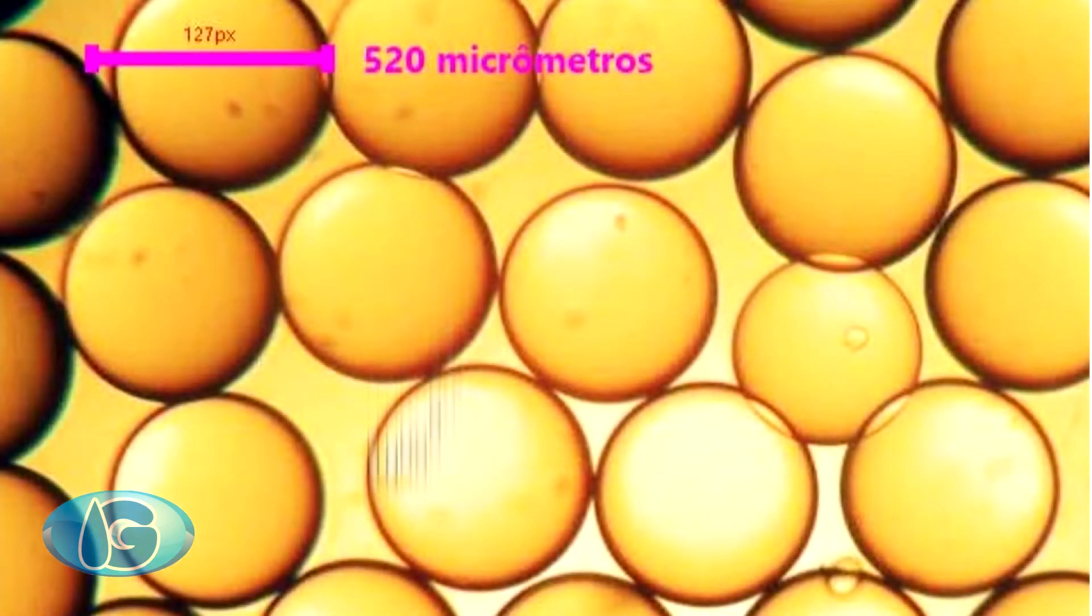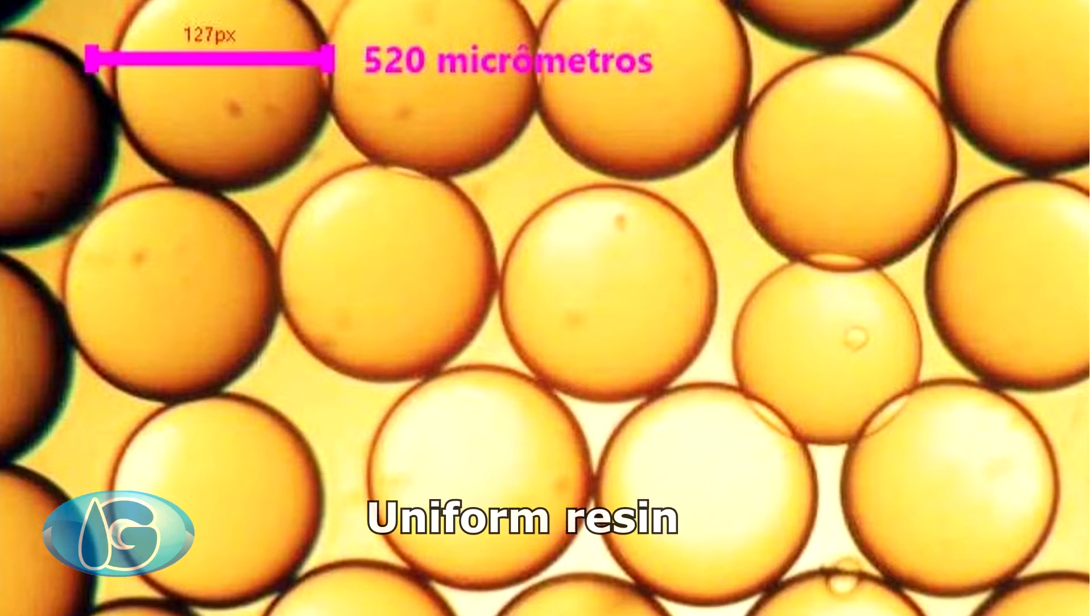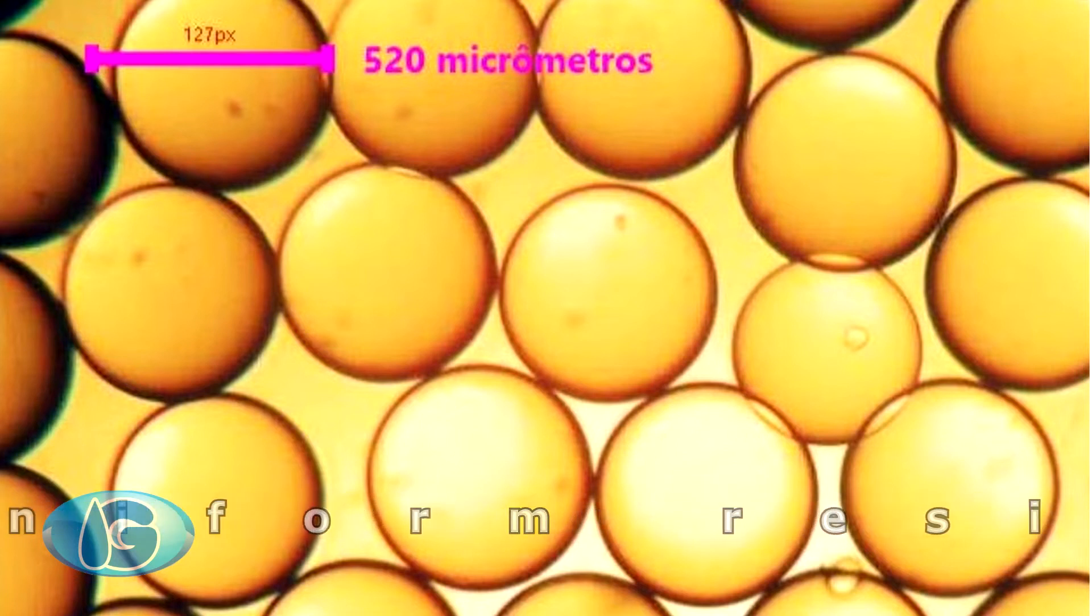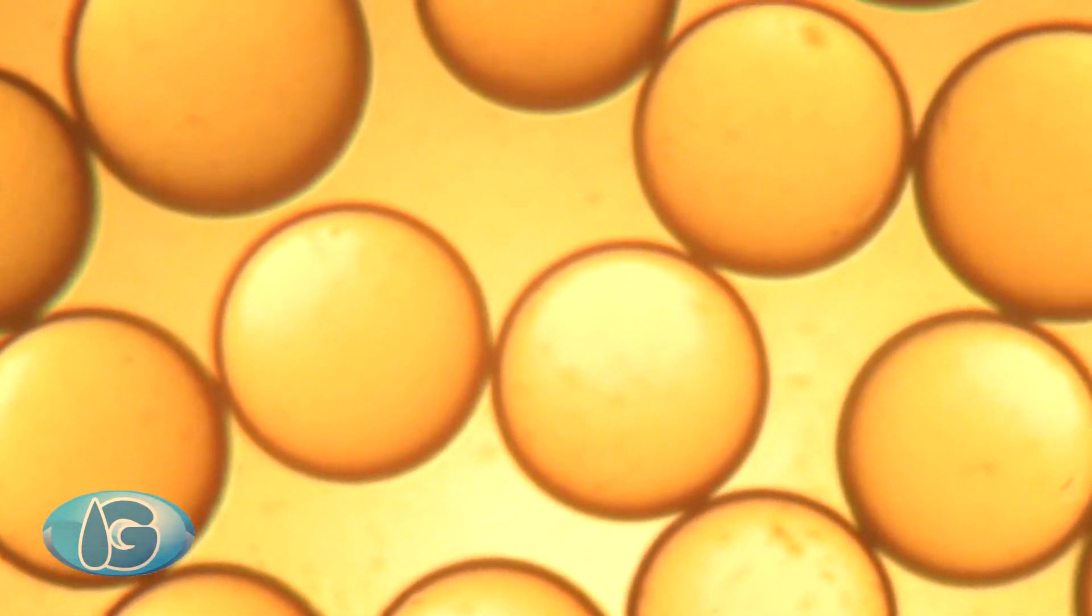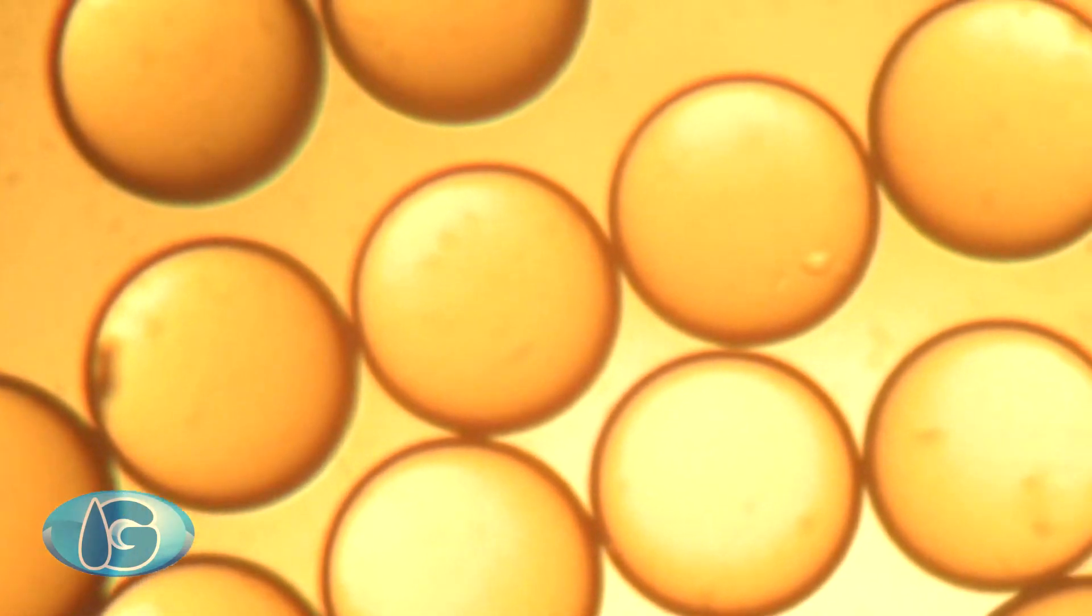Here we have a uniform resin. You can see a regular format of these spheres. We measure diameter and we found 520 micrometers. You can notice a very small variance of diameters. This is a better quality resin and obviously a higher price one. So it gives better results, reducing losses of resins through drains and crepings.